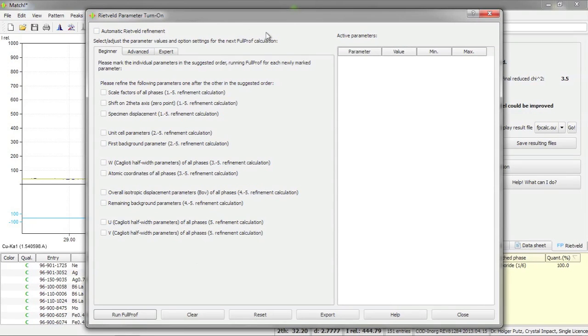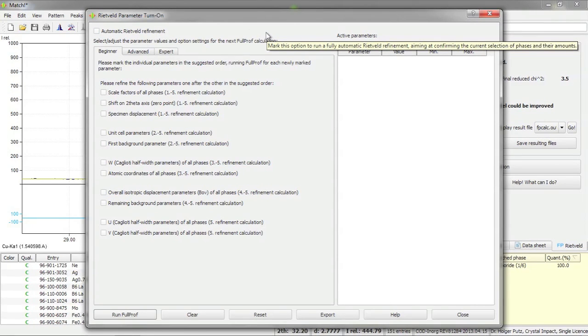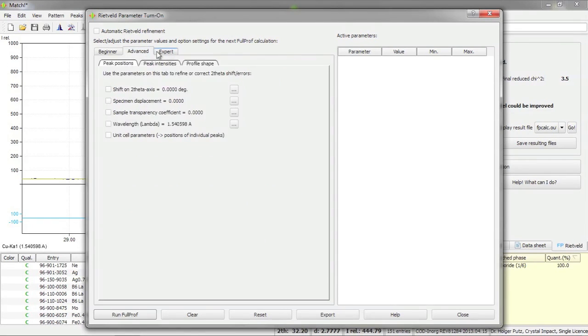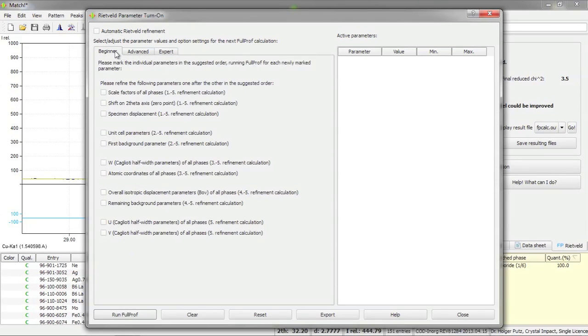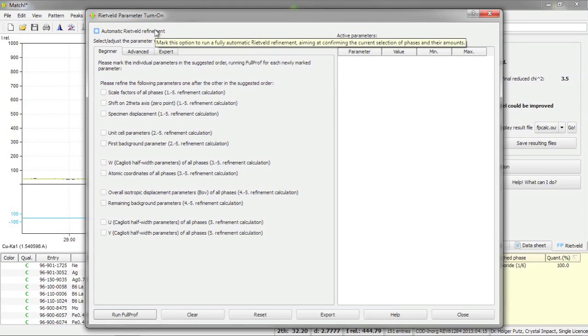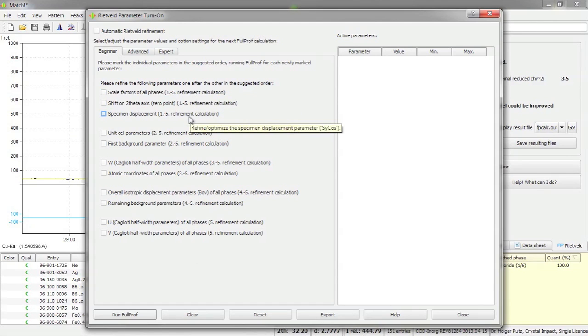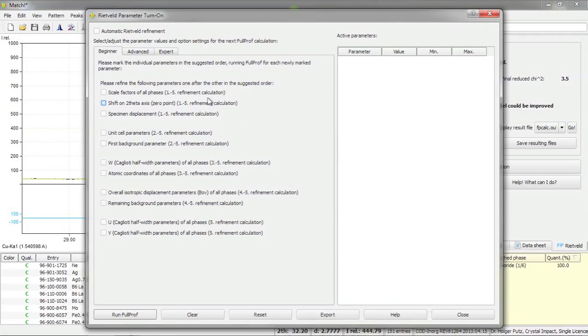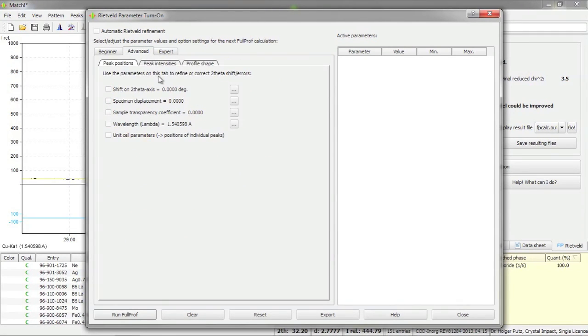Let me first give you a short overview over the parameter turn-on dialog. In this dialog you mark the parameters that you would like to refine in the next full prof calculation. The parameters are grouped according to three selections: beginner, advanced and expert. Here on the beginner tab you will find the most common parameters that are also used during the automatic Rietveld refinement along with a certain suggested order in which they should be included in the refinement process. But this is not mandatory, you can select any parameter as you like.